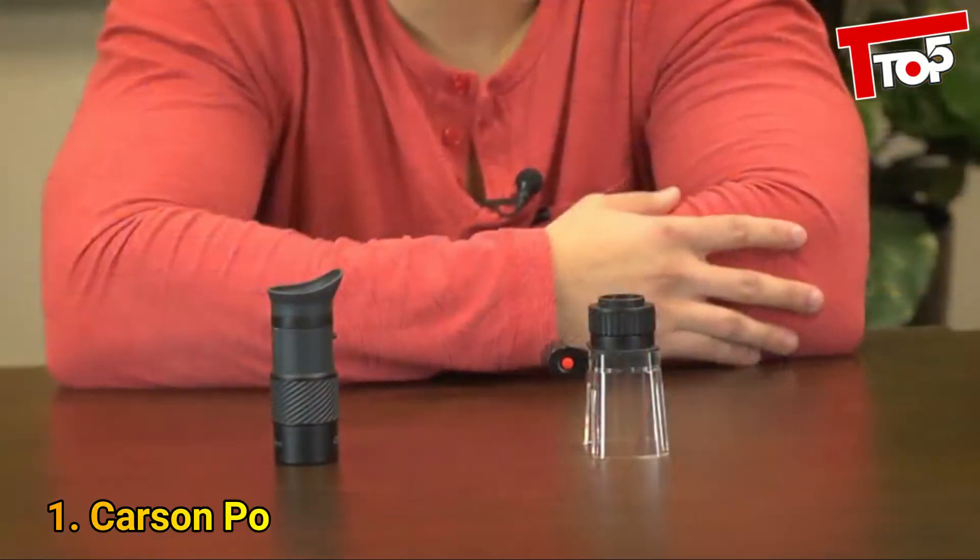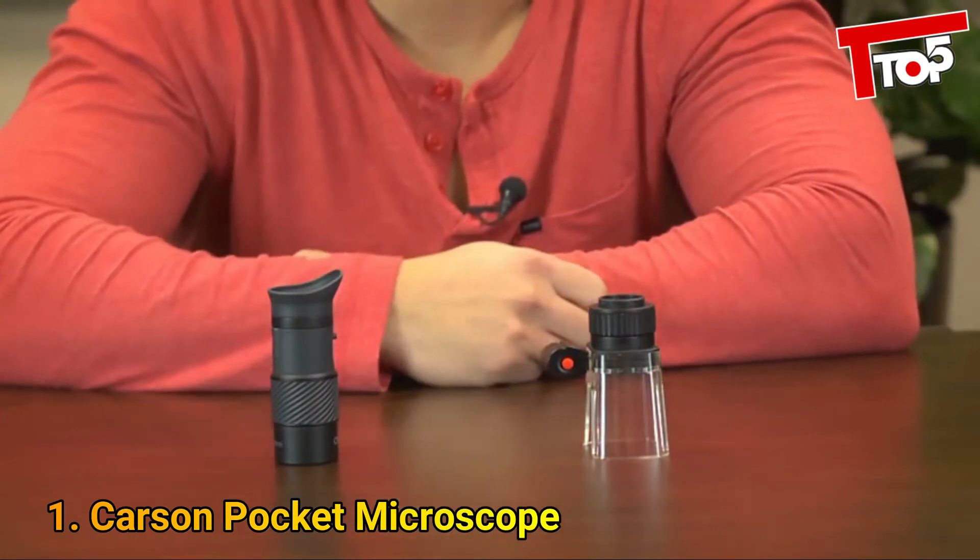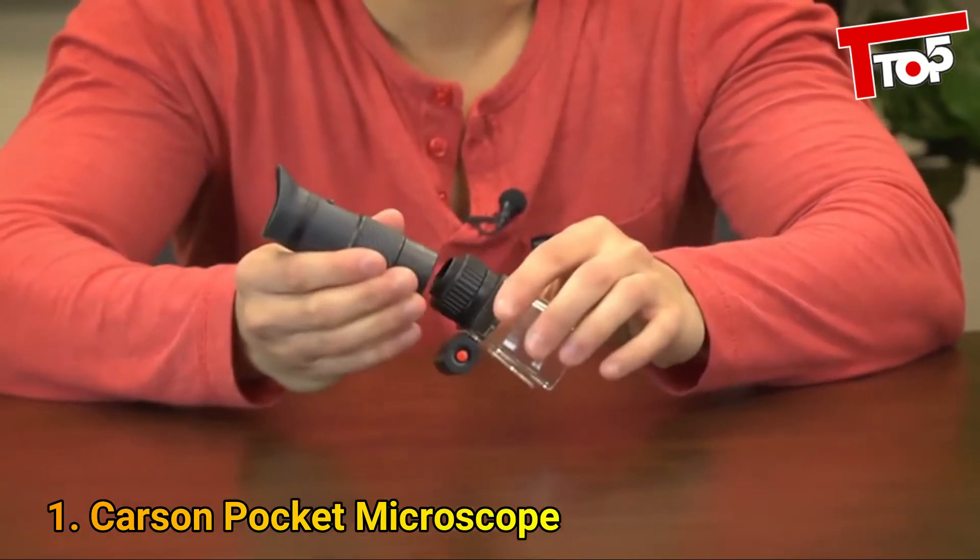Actually it's three useful devices. That's right. The Magnescope is actually a six power monocular, a four power eye loop, and a 25 power microscope.